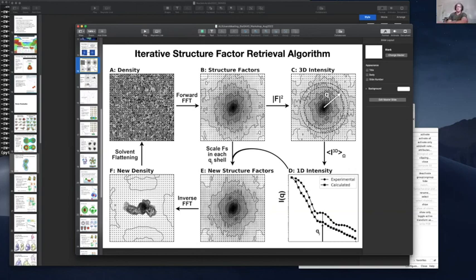Okay, thank you. But it's binned as minimally as possible. It's just one voxel per bin. That's typically for speed, I imagine. Yes, that's for speed. But if you don't care about speed, then it's okay to do this. So what happens is if you double the oversampling from 3 to 6, it makes the box size twice as large, but then all of your voxels will also become twice as large.